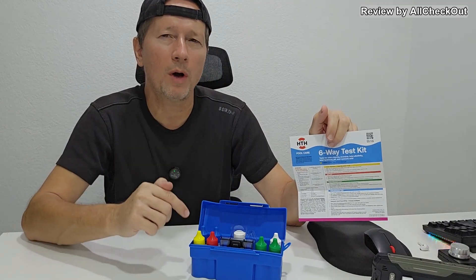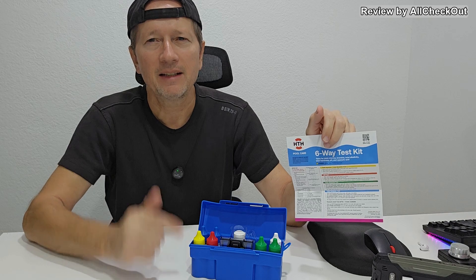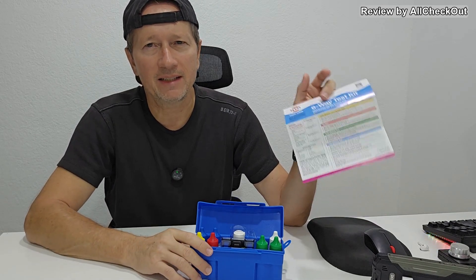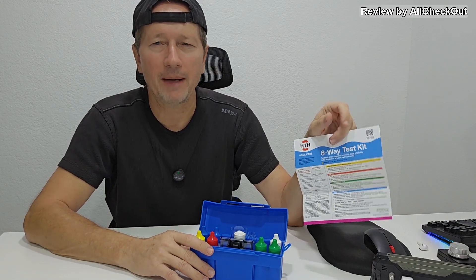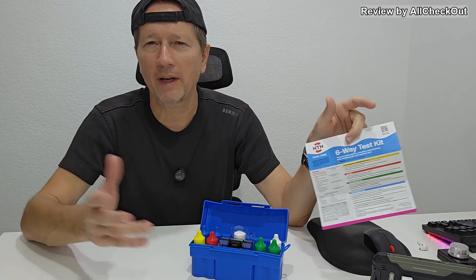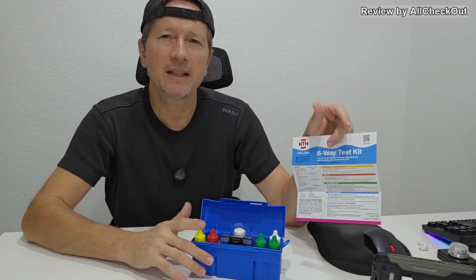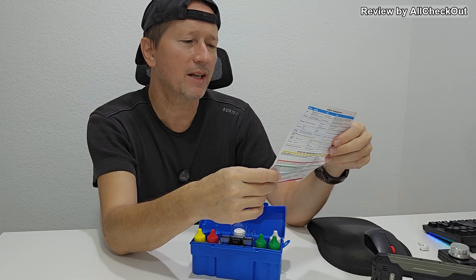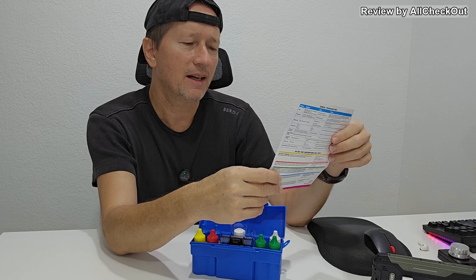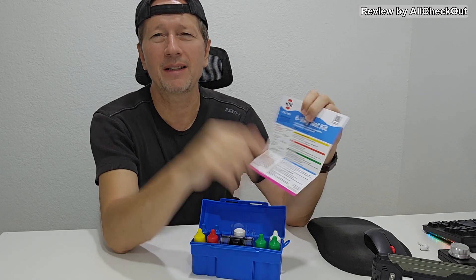The thing you really have to know about this test is that you can only test this two times, while the specs say you can use it around 100 times to test your pool water. This is only valid for all the other tests like chlorine, pH, alkalinity, and hardness tests.